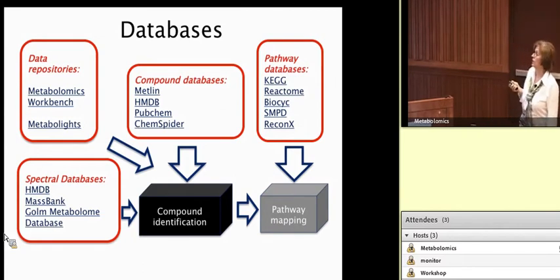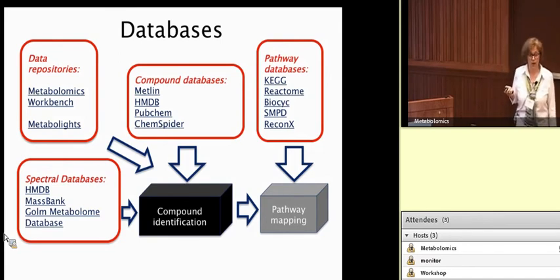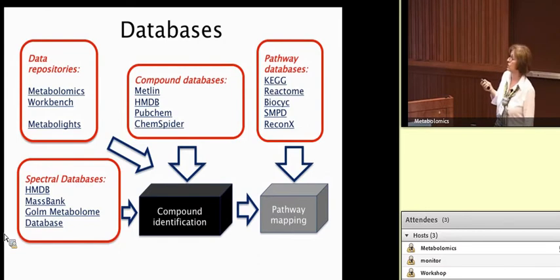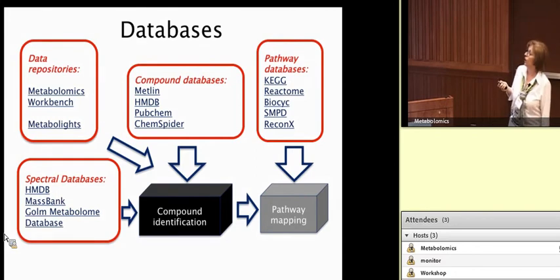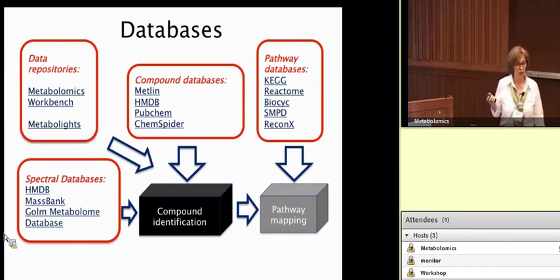Another newer category of databases, which we have not talked about, but which you will hear quite a bit about tomorrow afternoon, I believe, are the repositories for the experimental data. In particular, I want to mention the Metabolomics Workbench, which is being developed by the group at UC San Diego, who are our collaborators and partners.